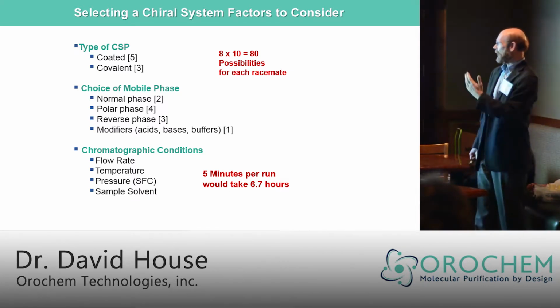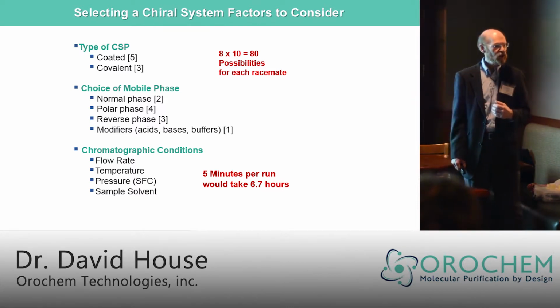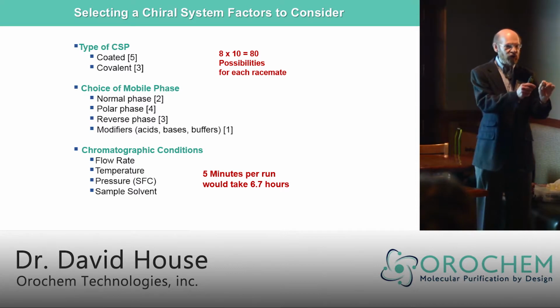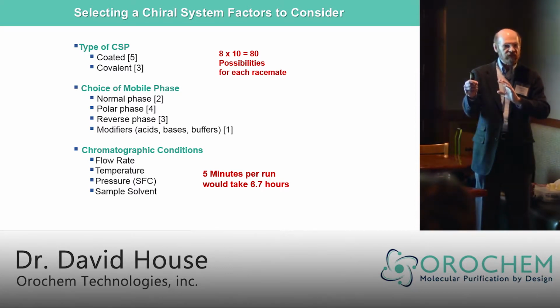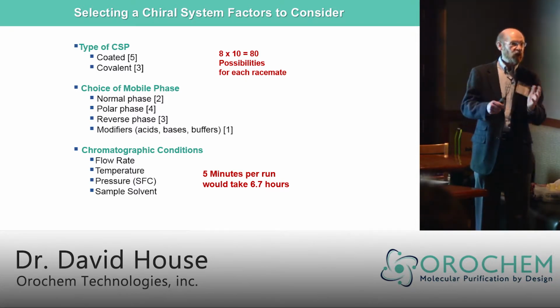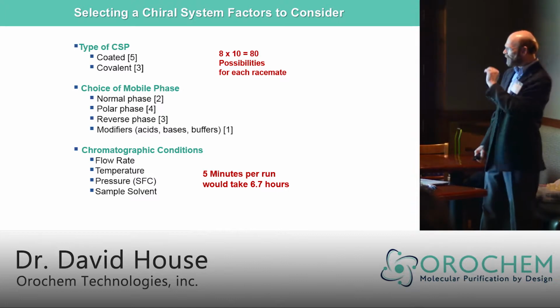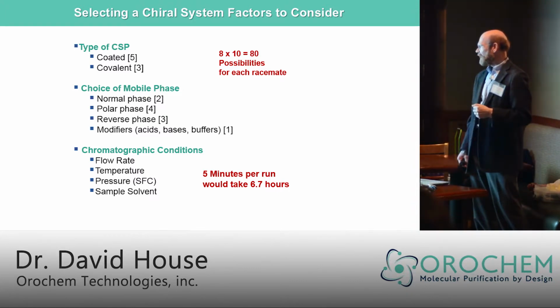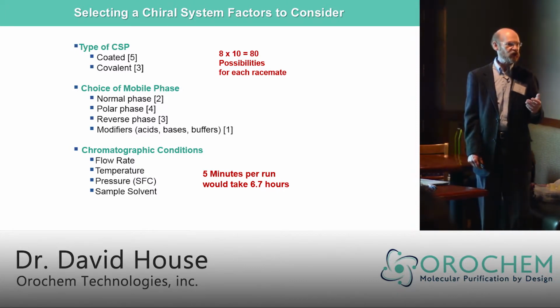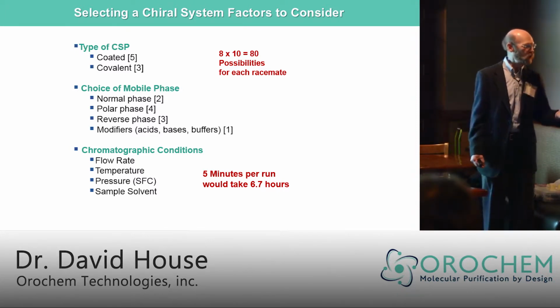Well, there have been a lot of efforts to decrease the time necessary to screen racemates, for obvious reasons. One technique is to use gradient mobile phases. You can do a lot of things faster. You can screen from relatively nonpolar up to very polar and do it relatively quickly. Now, you'll have to come back later and run it with, say, an isocratic system probably, but this is a fast way to do it. Most people will use an automated column and mobile phase screening device that can screen maybe 4, 6, even 20 columns. Set it up, let it run overnight.